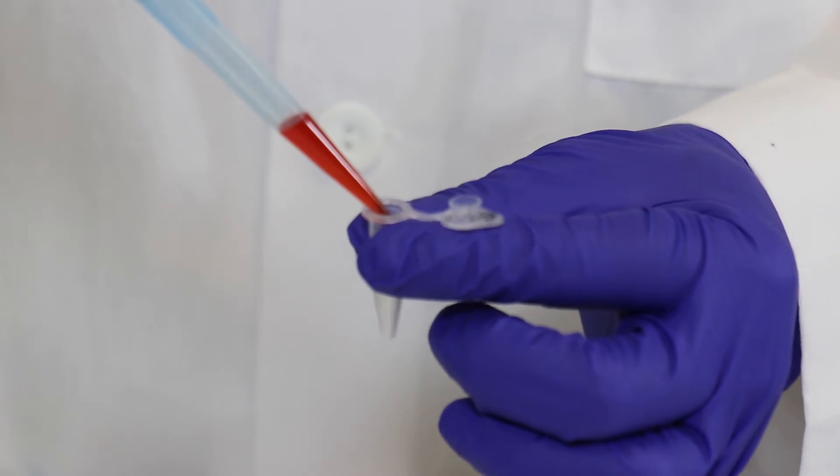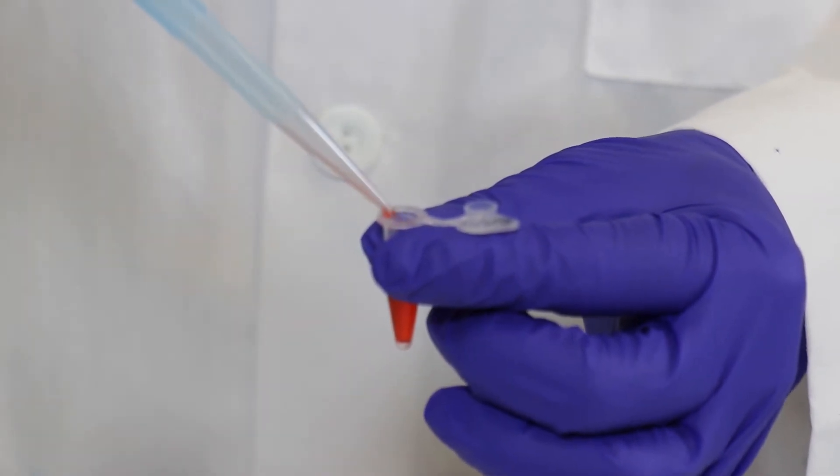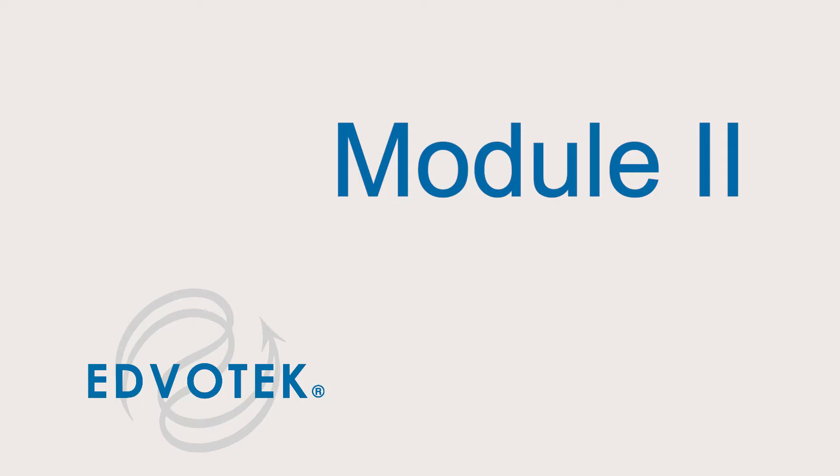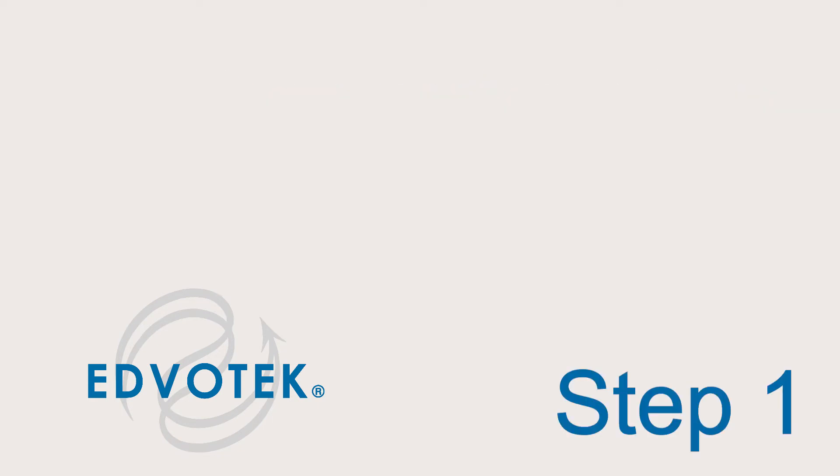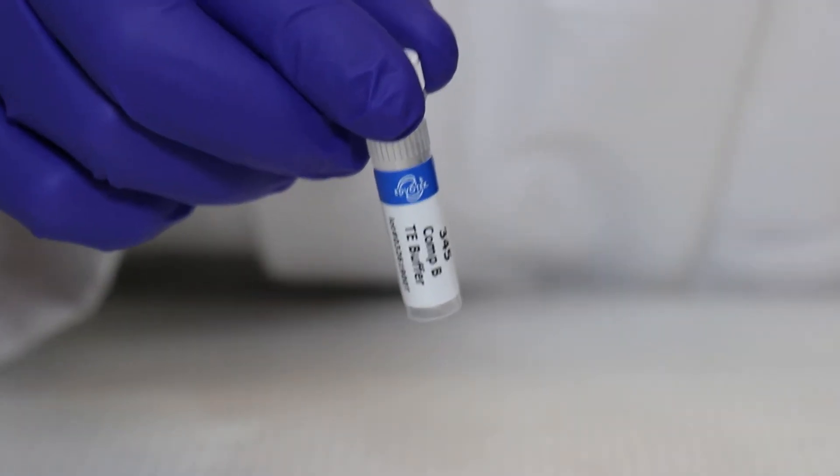Preparations for Module 2: preparation of the PTC primer mix. Step 1: thaw the TE buffer and mix well.